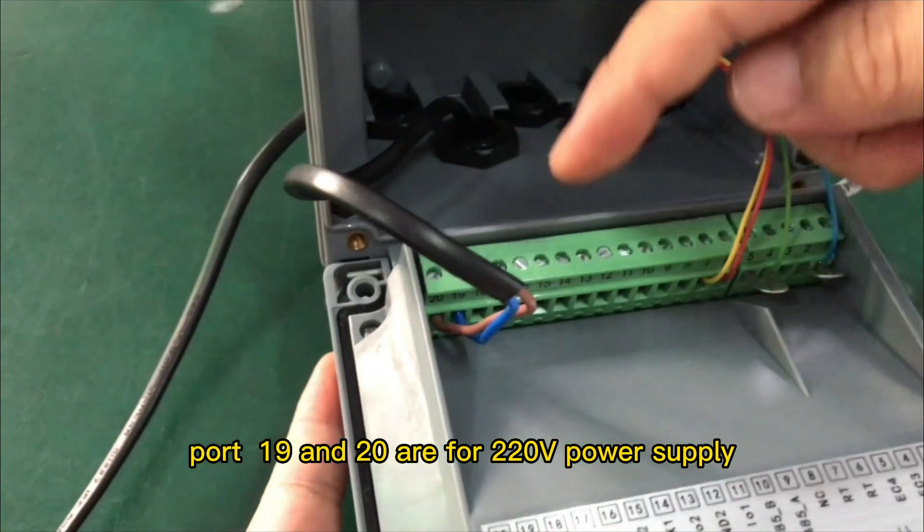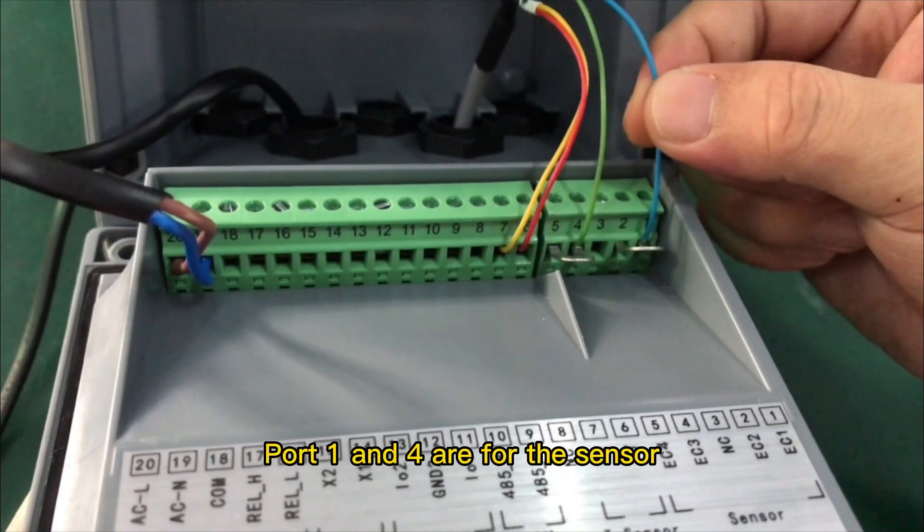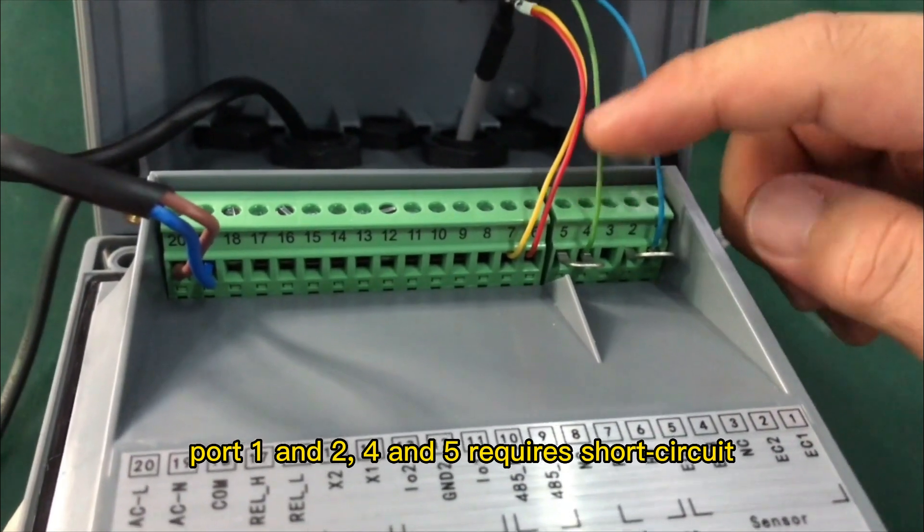Port 19 and 20 are for the 220V power supply. Port 1 and 4 are for the sensor. Port 1 and 2, and 4 and 5, require a short circuit.